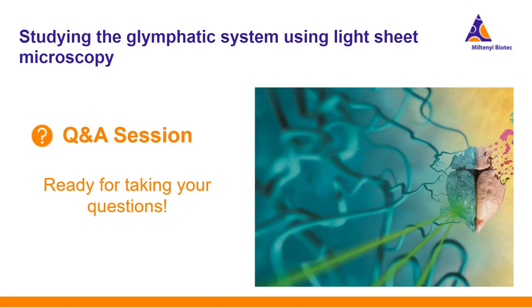Thank you. Our next question is, what is the main advantage of light sheet microscopy? Yeah, that's a nice question. I would say this is for the mesoscale or perhaps even macroscopic imaging. If you have a tiny sample, like I said, less than 100 microns, then confocal microscopy I would probably find to be superior.